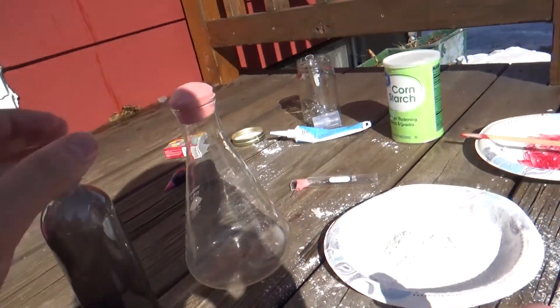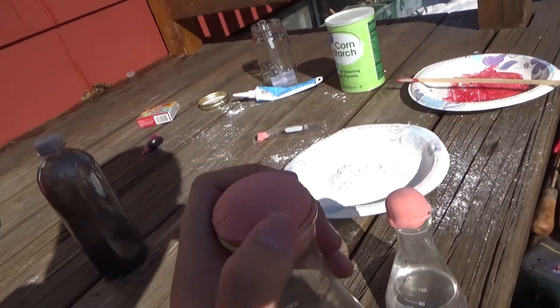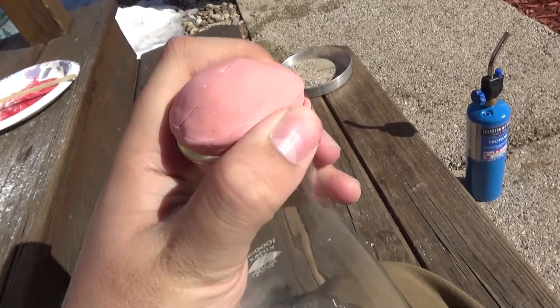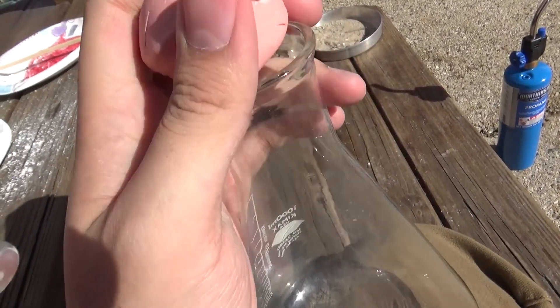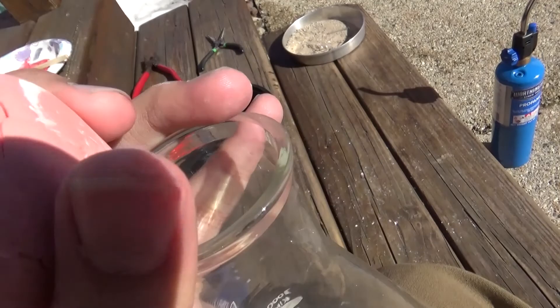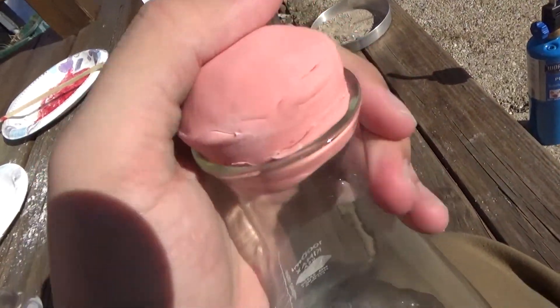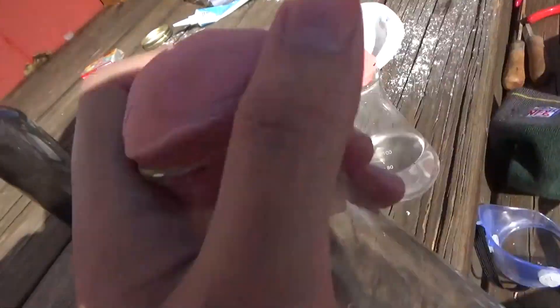If that works then hopefully this should work too. This is like a standard rubber stopper. I'll hold it in the light so you can see — I just took this piece, molded it into the perfect shape, and it should fit directly over the bigger flask, just like a standard rubber stopper. So if that worked, this should definitely work because it's basically a perfect fit.